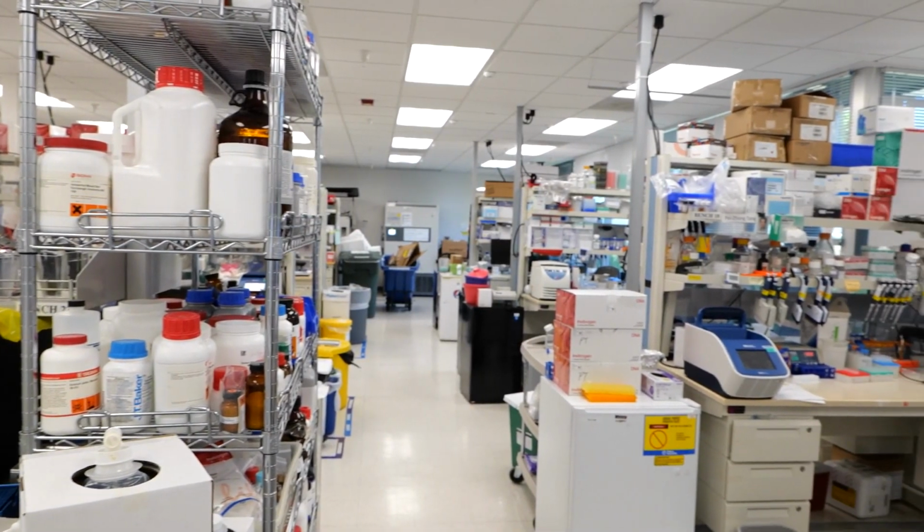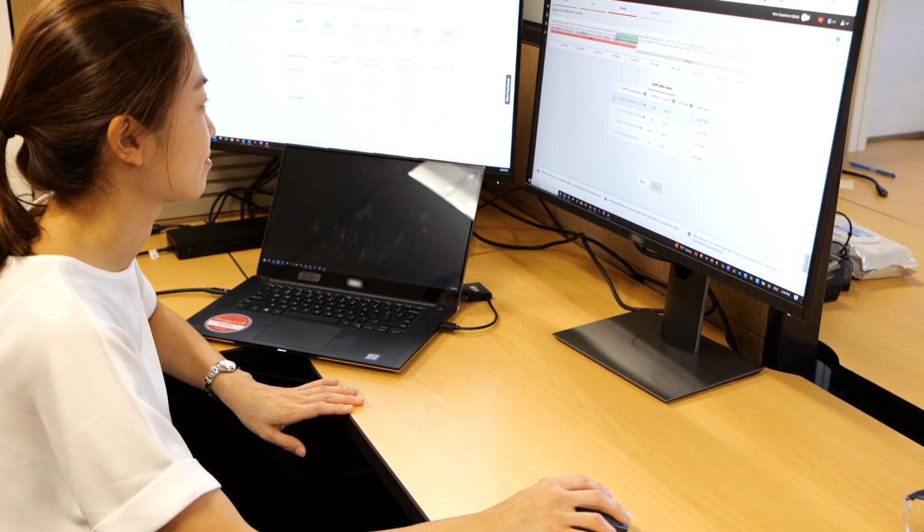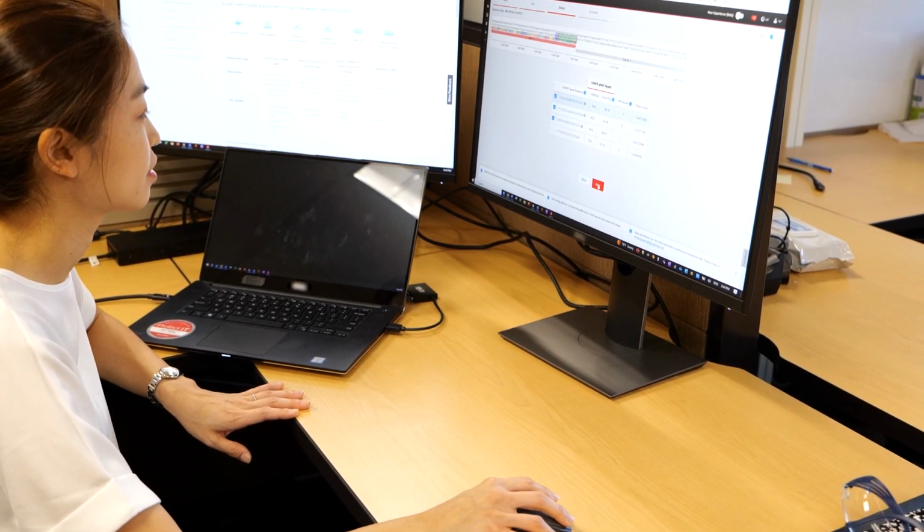In this video, we will demonstrate how to conduct a gene tagging experiment by tagging beta-actin with GFP in HEK293 adherent cells using Invitrogen CRISPR-Max transfection reagent and the Invitrogen TrueTag donor DNA kit.